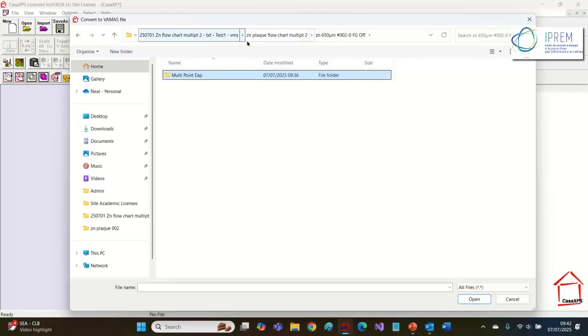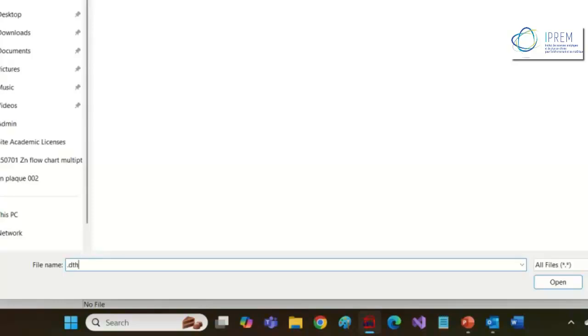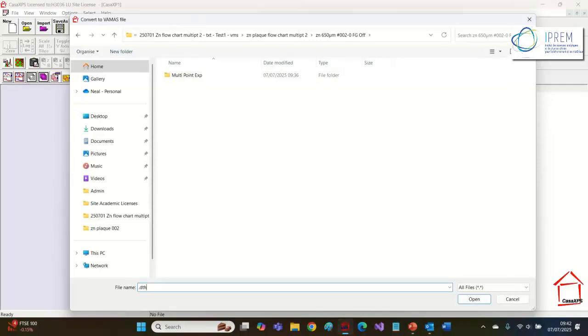Now, despite the length of this path, we can convert this multi-point experiment by using the .dth filter. So .d meaning directory, th meaning thermo. The th filters are more recent than the filters that correspond to a .dvg, for example. If it ends in vg, that's an older version of the filter. If it ends in th, that's a newer version of the filter and can cope with far more intricate experiments than the older VG filters. So I've entered .dth and I just say open.